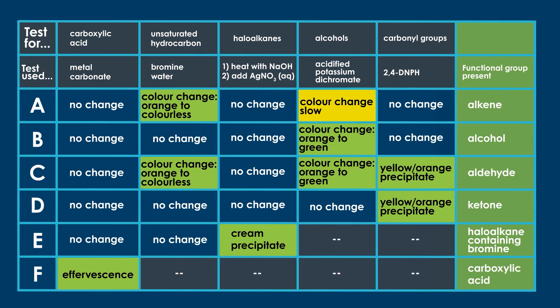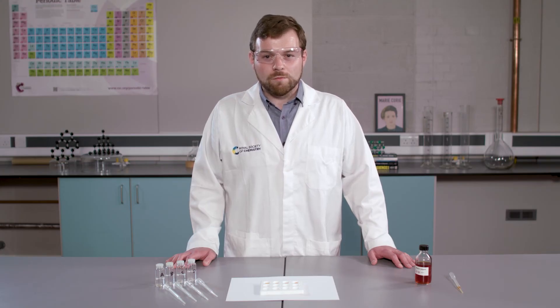So if we take a look at our results we have had so far, we can conclude the following. The metal carbonate test gave only one positive result, sample F, so that must have been the carboxylic acid. The silver nitrate test gave only one positive result, sample E, so that must have been the haloalkane. The bromine water test gave two positive results, sample A and sample C. However now we have conducted the test with Brady's reagent, we can see that sample C has given a positive result whereas sample A has given a negative result. Therefore sample C is our aldehyde and sample A is our alkene. Sample D has given us a positive result with Brady's reagent and gave us a negative result with acidified potassium dichromate, so sample D must be the ketone. Sample B gave us a negative result with Brady's reagent and a positive result with acidified potassium dichromate, so sample B must be our alcohol. Now we have identified the functional groups in all of our compounds, A through F, though we are not done here. I have one final test to show you.